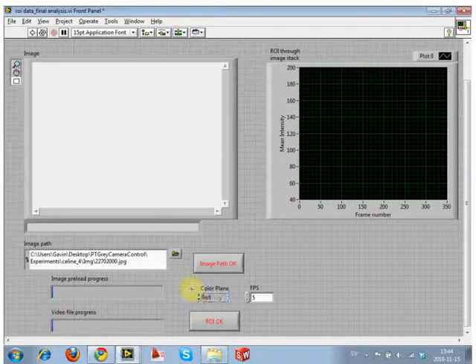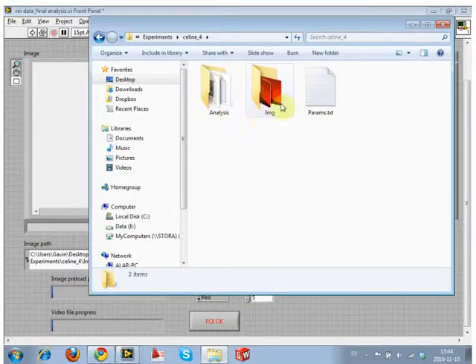Is it HSL or is it RGB? I think it's RGBI, which is 64-bit that has a fourth level. But anyway, it does exactly what you'd expect, but this time, rather than putting anything in this data folder, we make a new folder with all of our stuff in it. And it does it itself. We don't name anything. It's all back-end coding.